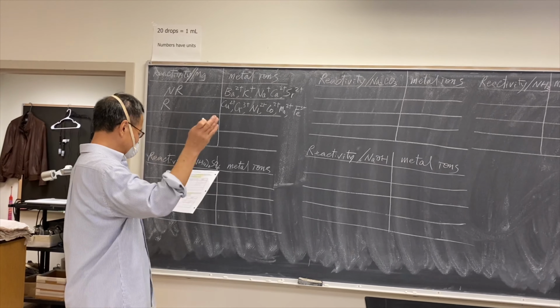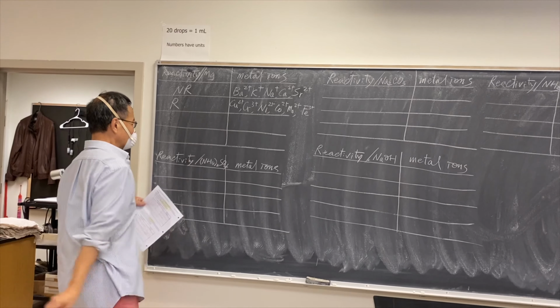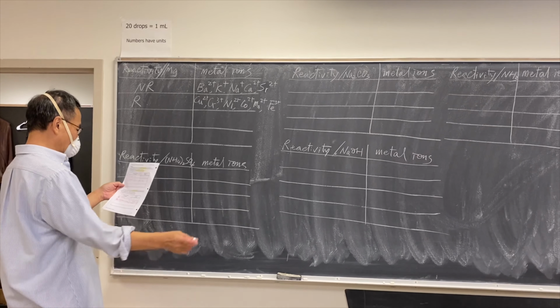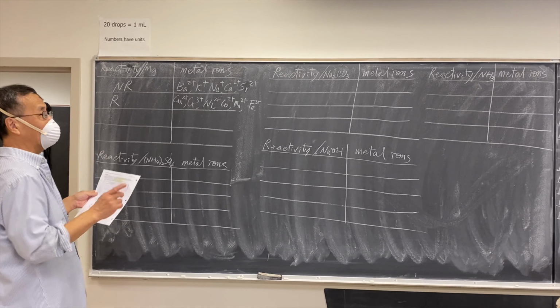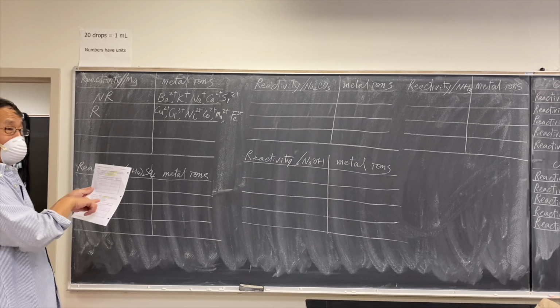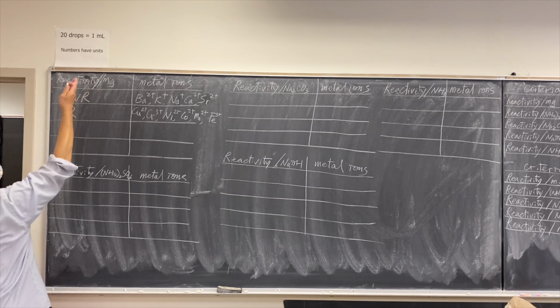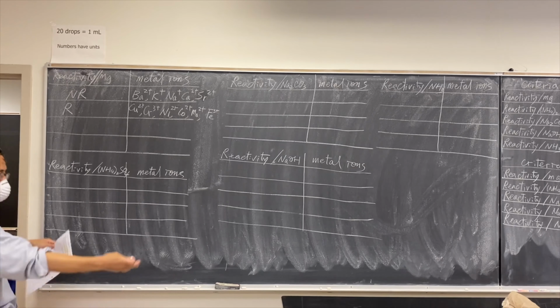All right, and then the following one, you are asked to group all your ions based on the reactivity with ammonium sulfate.